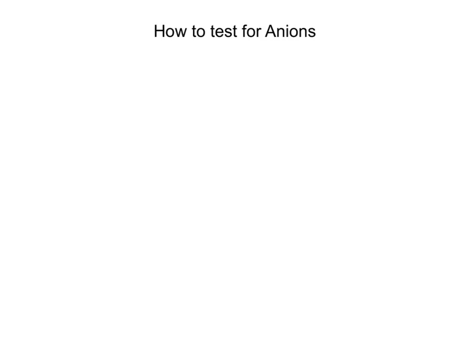Hello everyone, in this video I'm going to be talking about how you can test for anions. Now anions are negatively charged ions, we'll just put that by the title. And this is one of two videos that I'm doing looking at how you test for these particular ions in an unknown sample. It's part of what we call qualitative analysis in inorganic chemistry.